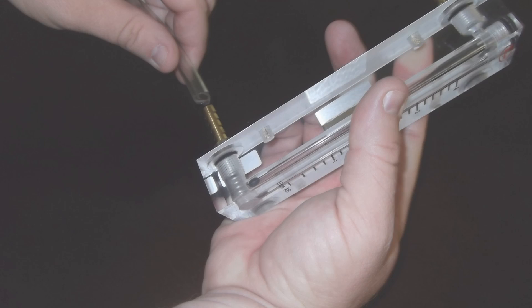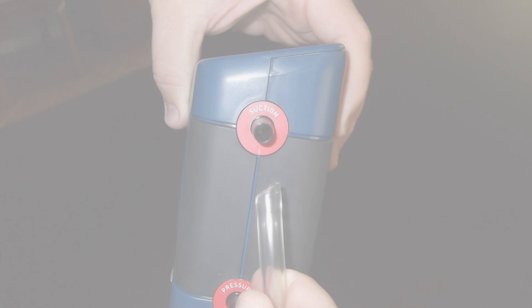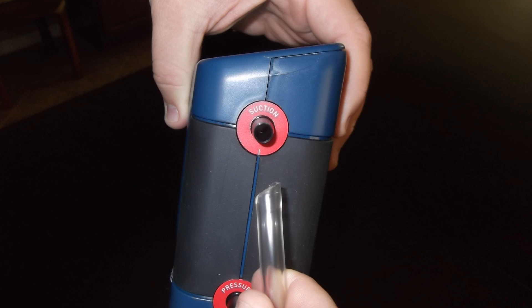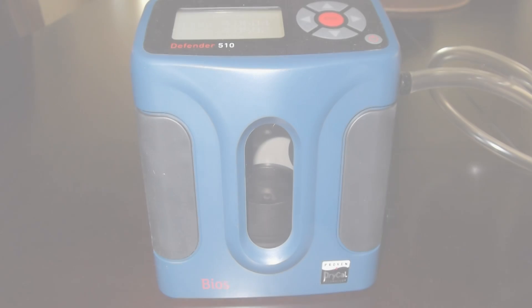Then connect the suction or bottom hose barb to the tubing and connect the opposite side of the tubing to the suction inlet on the primary calibrator. In this video, we are utilizing the BIOS Defender 510 Dry Calibrator.